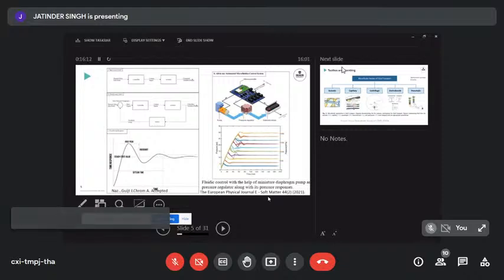For some microfluidic systems, you want to be above your steady state or at your steady state as soon as you can. You don't mind if there's an overshoot, but you want to get as soon as possible to your flow because you don't want any of your analytes disappearing into another channel. For other applications, however, you may be very pressure sensitive. So you want to avoid an overshoot at any cost, which means that you want to have a very slow ramp and then approximate that level with as little overshoot as possible.